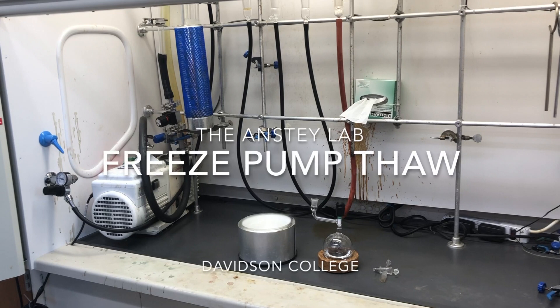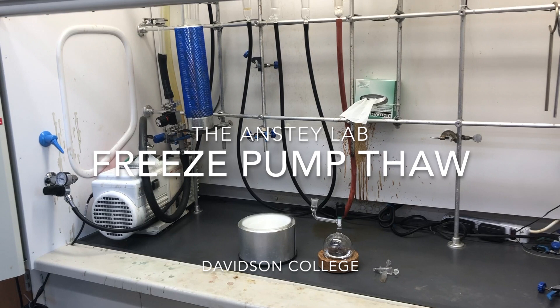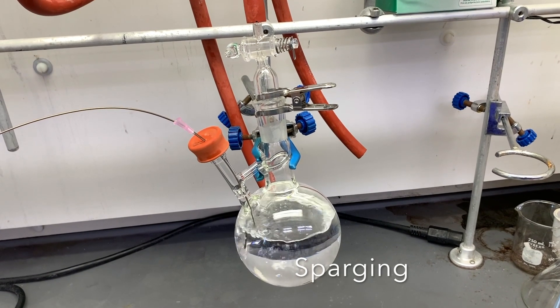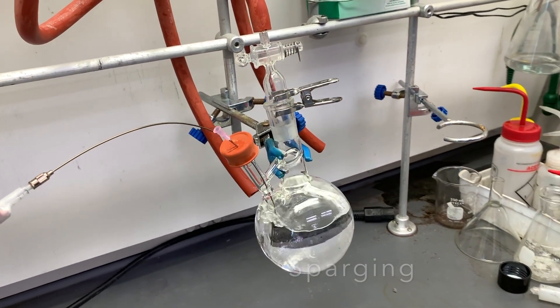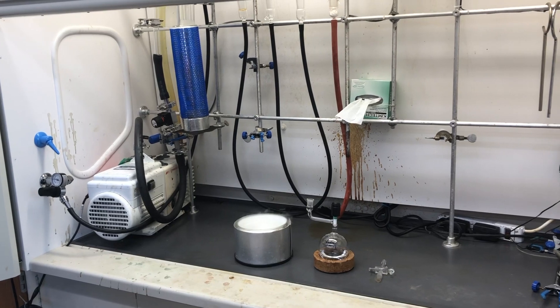Working in an anaerobic environment like the one we have on the Schlenk manifold or under a glove box means that oxygen dissolved in liquids must be removed before we can use them. We've already done a video about sparging, which removes dissolved oxygen through bubbling but results in significant evaporation. If you have a precious liquid that you can't afford to lose to evaporation, or that is hazardous to risk exposure to fumes, then it's time to opt for freeze-pump-thaw.